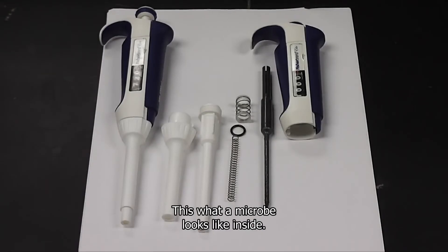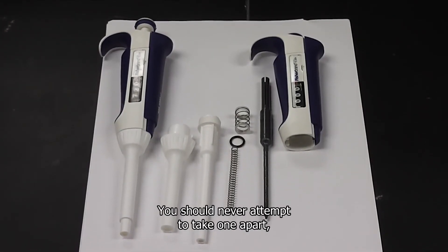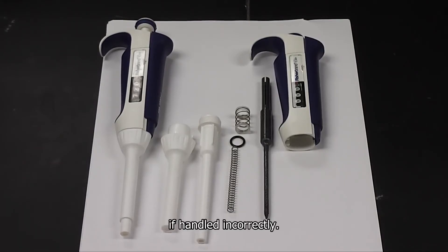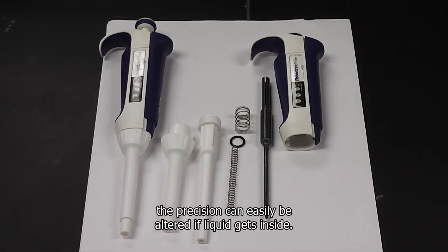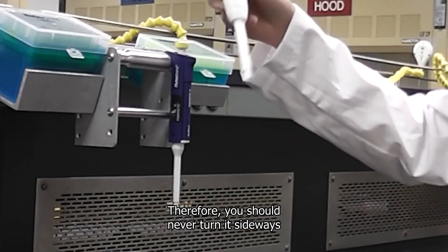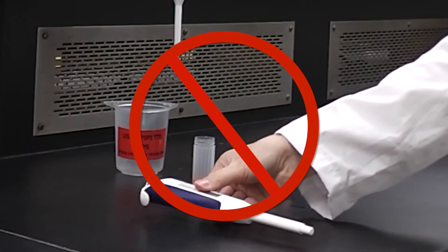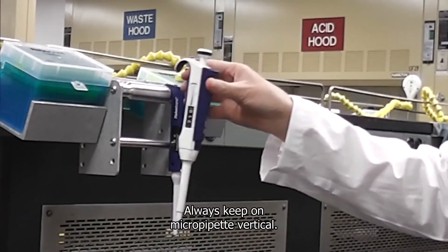This is what a micropipet looks like inside. You should never attempt to take one apart, as the springs and plunger can be permanently damaged if handled incorrectly. Although the parts appear very basic, the precision can easily be altered if liquid gets inside. Therefore you should never turn it sideways or lay it on a bench.